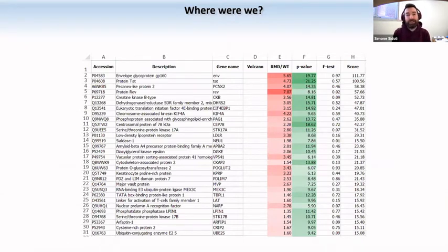We discussed how you convert a raw proteomic table into a table sorted by a significantly enriched feature. You remember that we discussed how to look for enrichment by generating a fold change, how to study the confidence of how reproducible your observation is by calculating a p-value.